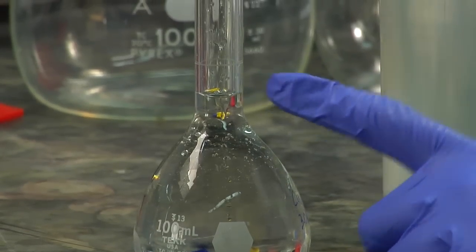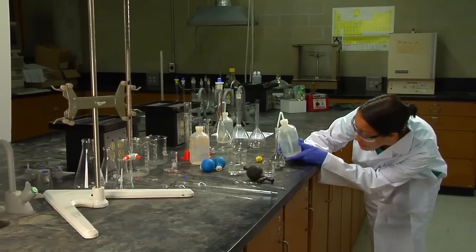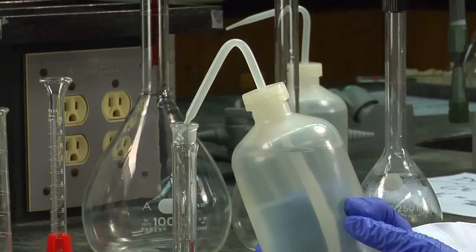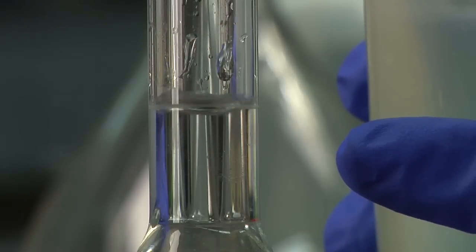Just because the end of this is about 1 mL to 2 mL, you can fill it up very quickly. Use this to accurately ensure that the bottom of the meniscus sits at the top of the line.